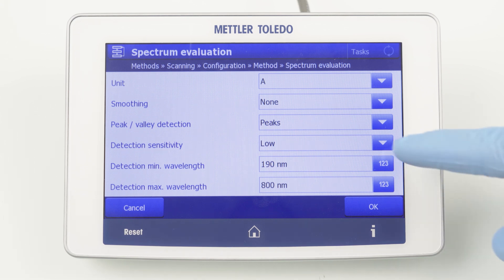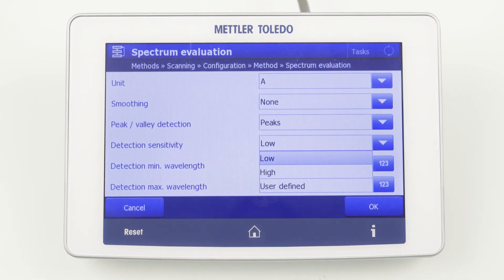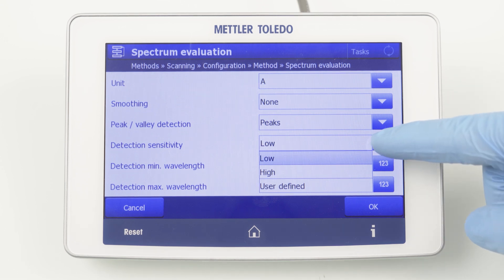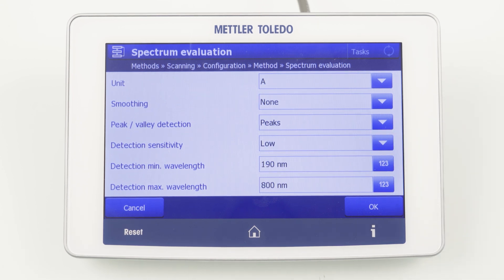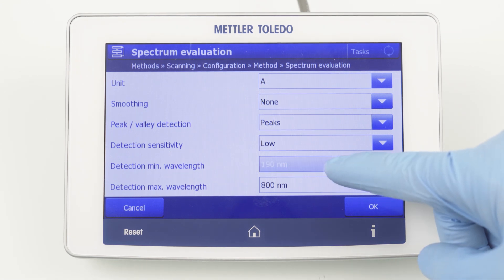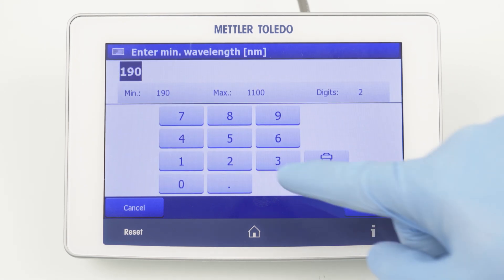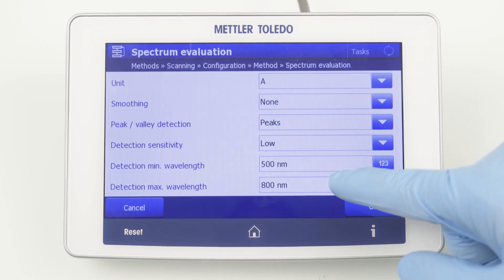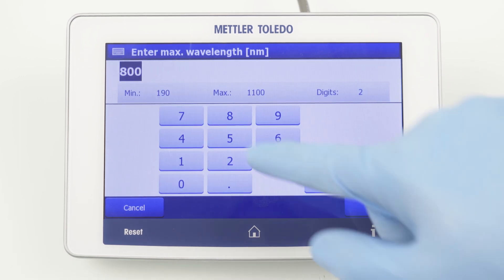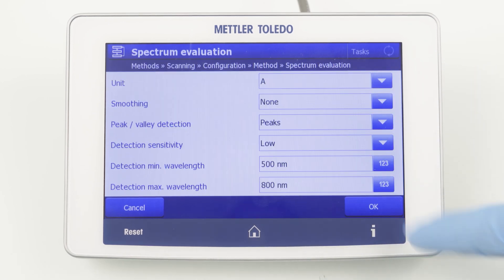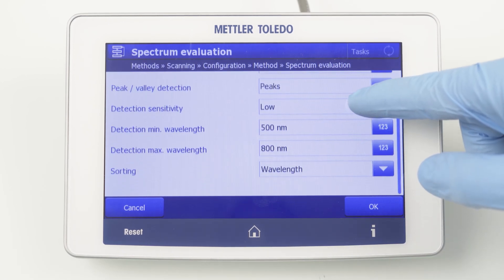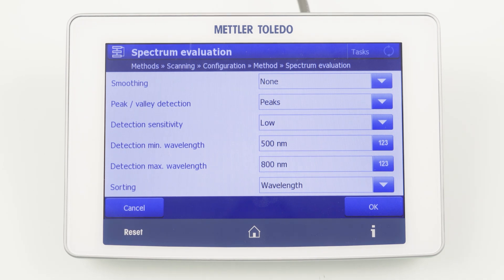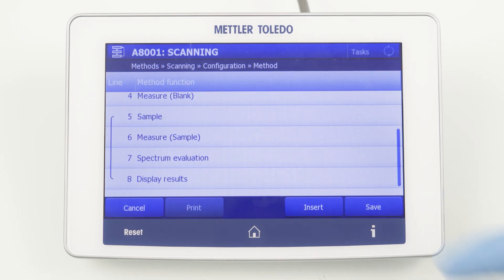The sensitivity of the algorithm can be tuned — you can select between low, high, or user-defined. Finally, you can define in which region of the spectrum the algorithm should be applied. The literature already gave us a hint that the expected maximum is between 500 and 800 nanometers.